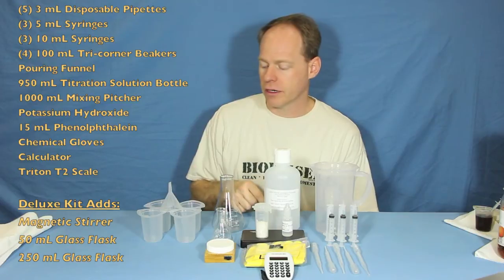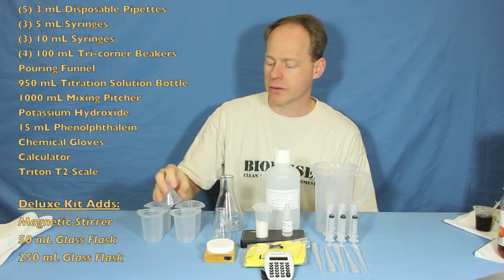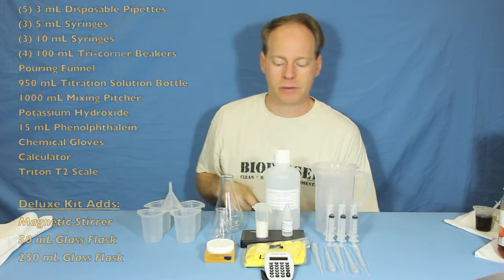We also include four of our tri-corner beakers, a funnel to pour the water into the kit with, and a pair of safety gloves as well.